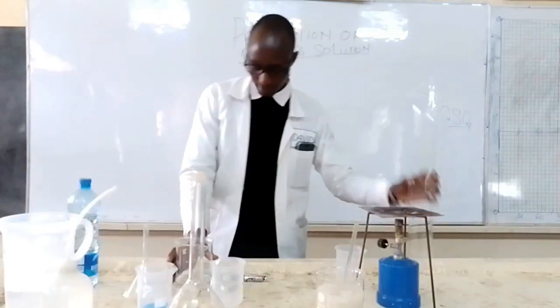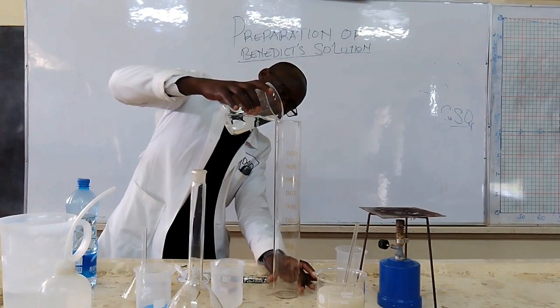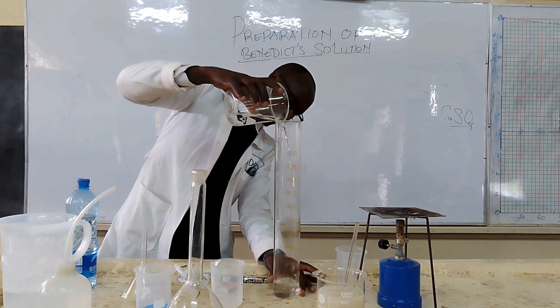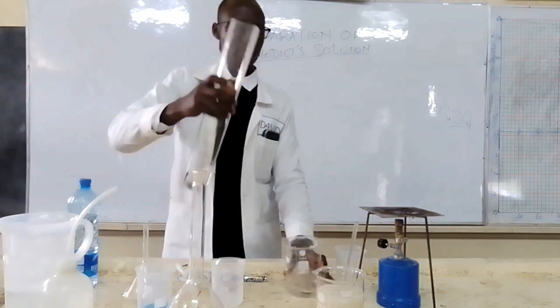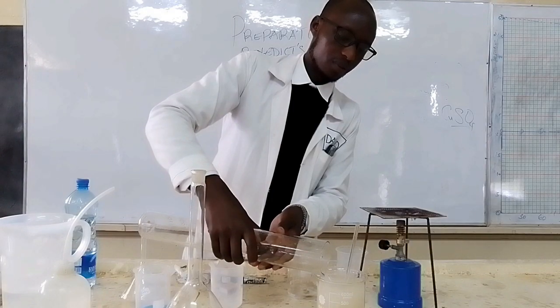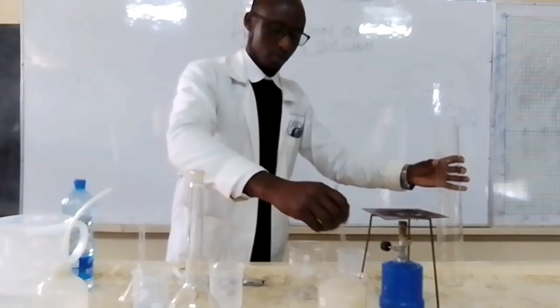So I may add 100 ml of water, about 100. It's about 100 ml of water to ensure that it is going to dissolve. So continue stirring the two.